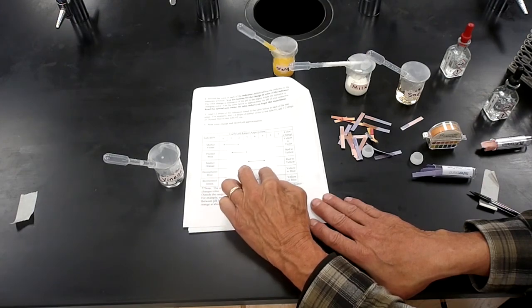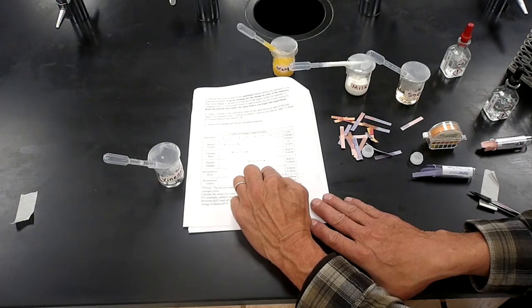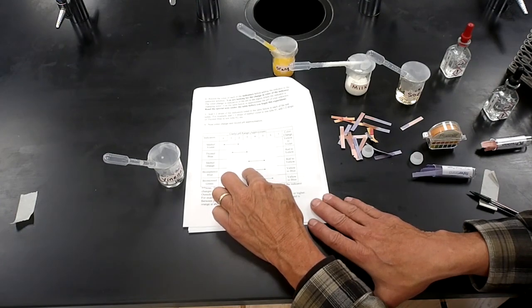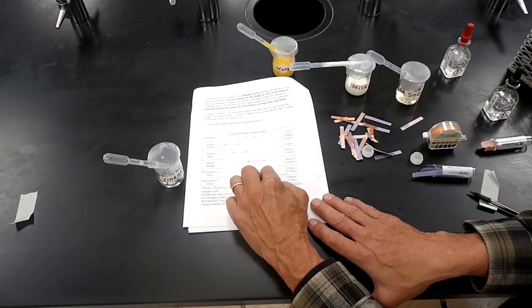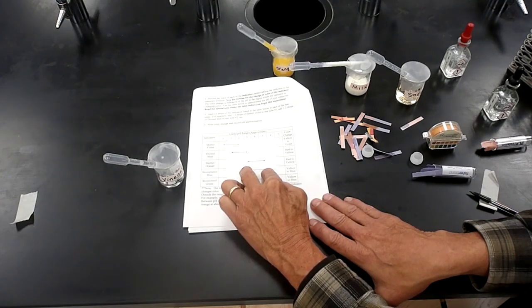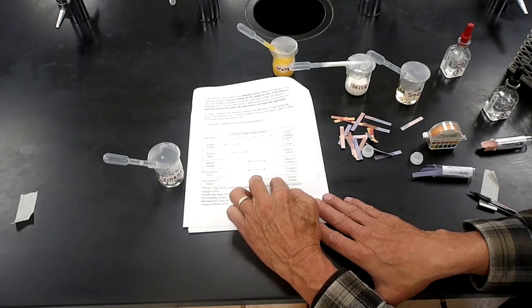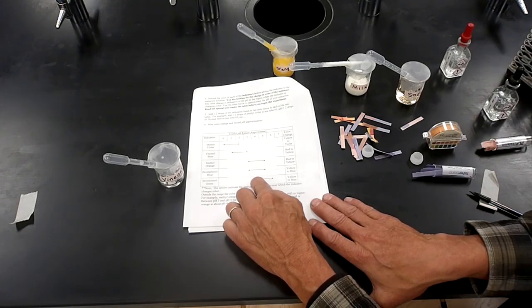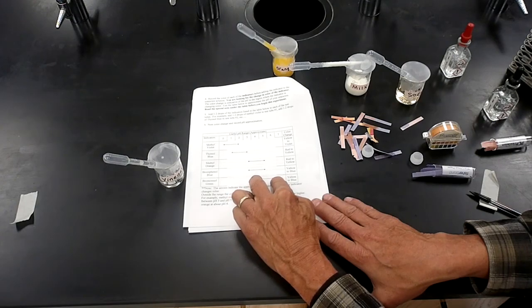Bromphenol blue is very similar. It'll be yellow below a pH of 4, and it'll be blue above 5. Between the ends of the arrow, it might have a transitional color. And the last one, bromcresol green, is sensitive between about 4 and 6. So below about 4, it'll be yellow. Above 6, it'll be blue. Between those two points, it might have some sort of transitional color.